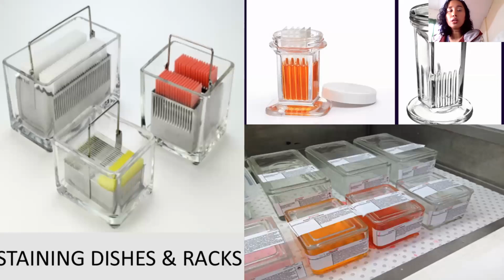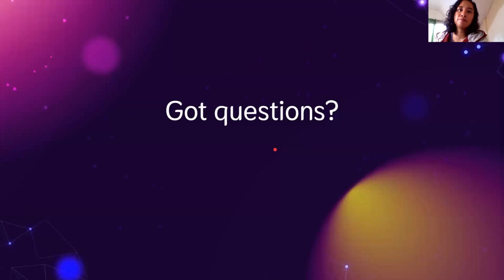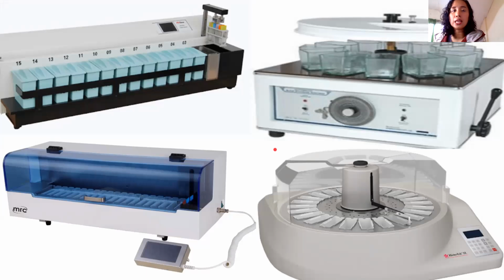Yan. So guys, just review yung mga staining rack, coupling jar, yan. Yung mga staining dishes. Yan, yung automated stainer natin. Yan, stainer to kasi nga staining dishes yung ginagamit. So, mas maliit. Yan, for staining siya ng H&E. So, especially if you are staining a huge batch of slides. Yan, maganda. At there is consistency with draining, with agitation, with washing. So that's it, guys.